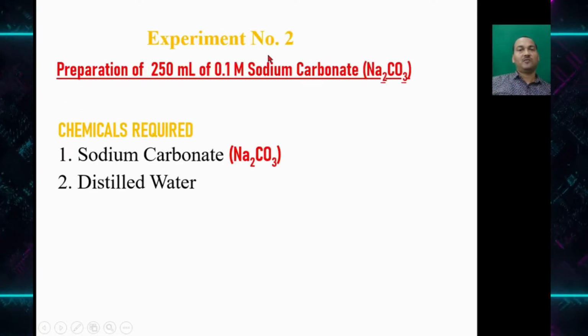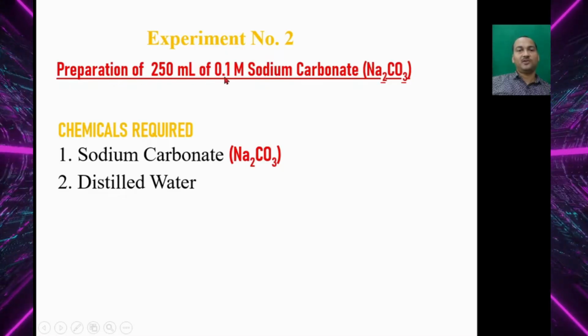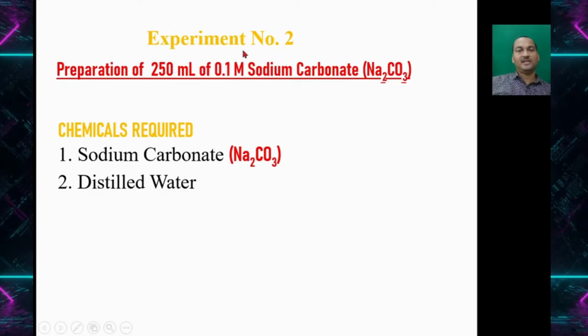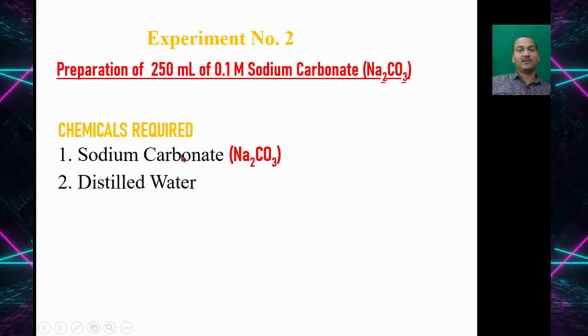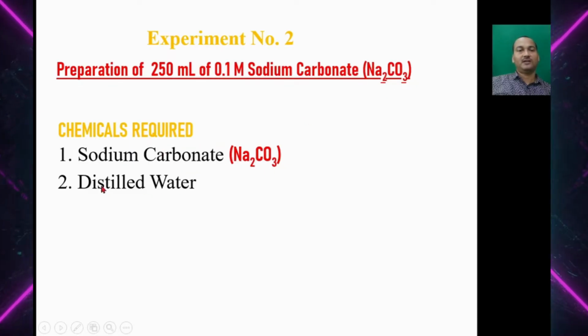So experiment number 2, let's prepare 250 ml of a 0.1 M, that is molarity, of sodium carbonate. So what are the chemicals required? Na2CO3, sodium carbonate, and distilled water.